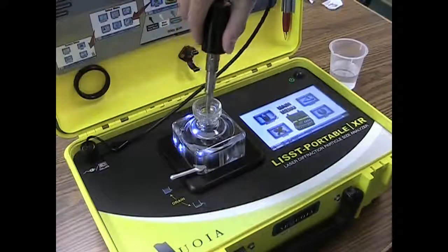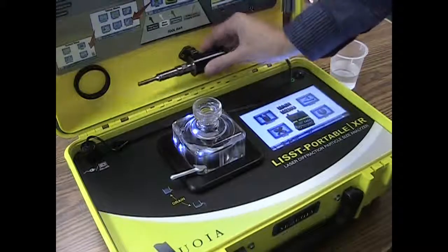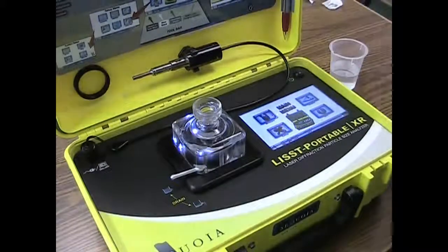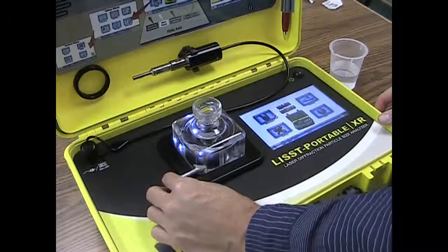Once the sample is well mixed, remove the ultrasonic probe, drain a small amount of water from the chamber, and then pour in your mix of water and particles.